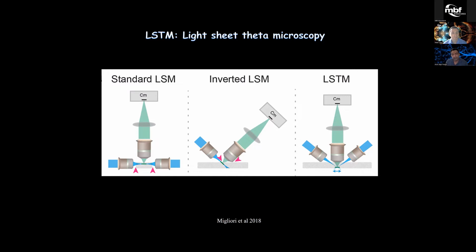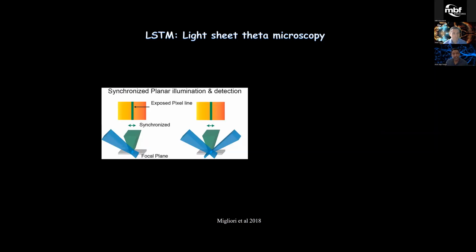Just first, a little bit technically how we are doing the scanning. So the idea here is that you have this blue light, which we are using to generate this thin sheet, right? And it intersects with this focal plane. That's the focal plane here. It intersects the focal plane in a line which is illuminated, which produces signal. And then we scan this line in the focal plane in synchrony with the rolling shutter in the camera chip. So with this sCMOS chip, we can take images in a rolling shutter mode, where you only expose a few rows at a time, which you can roll.